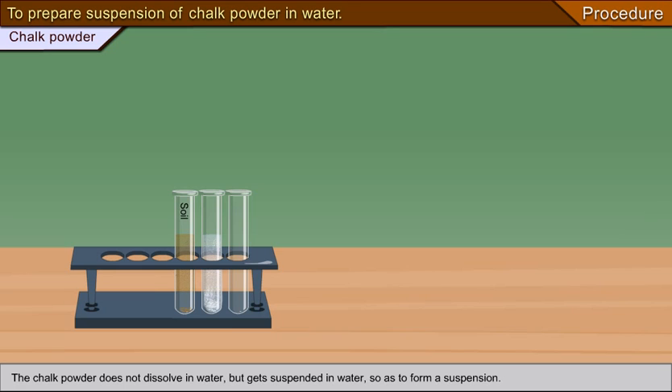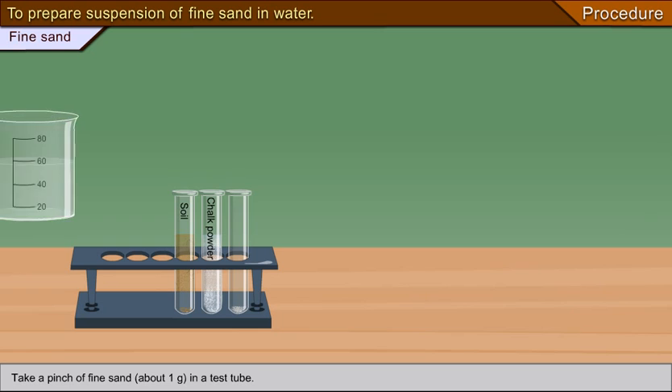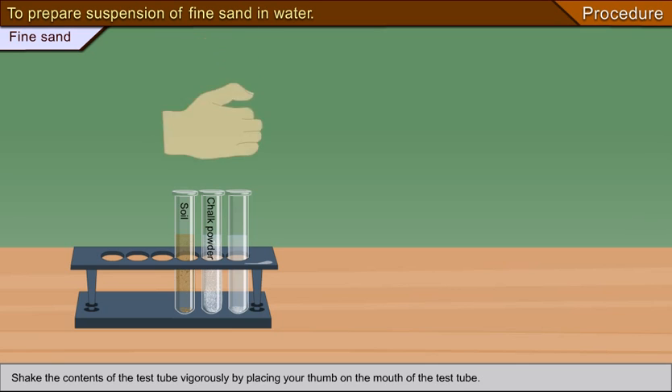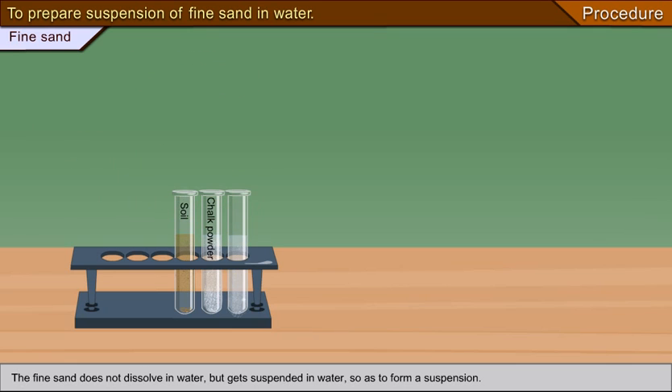To prepare a suspension of fine sand in water, take a pinch of fine sand (about 1 gram) in a test tube, pour about 10 cc of distilled water, and shake the contents of the test tube vigorously by placing your thumb on the mouth. The fine sand does not dissolve in water but gets suspended in water to form a suspension.